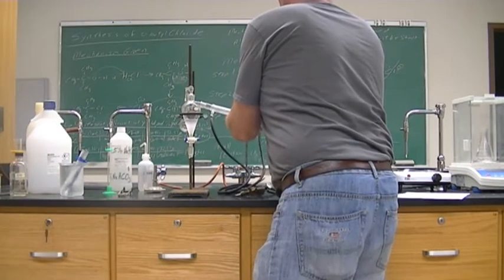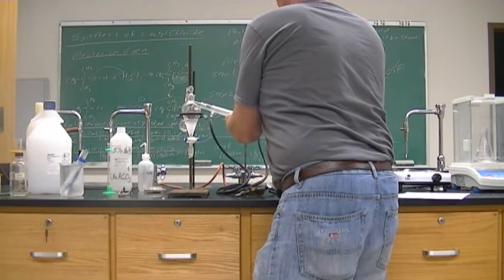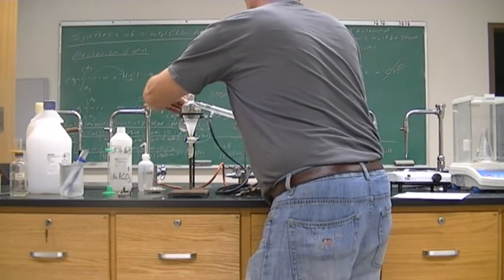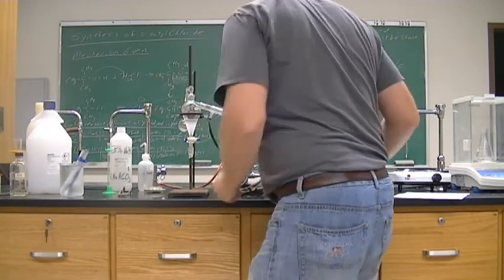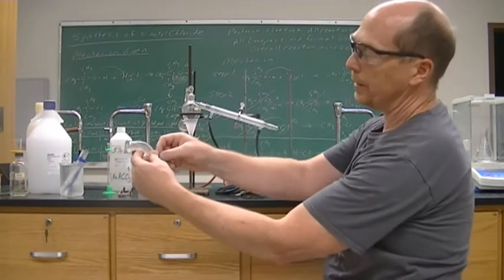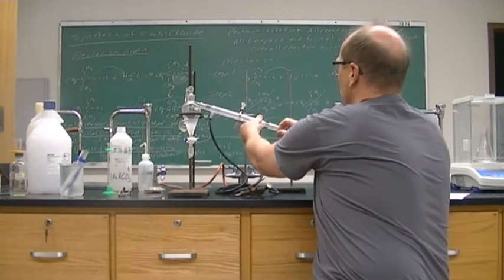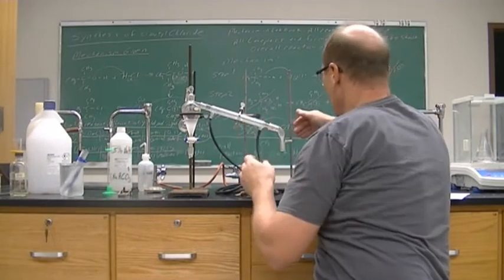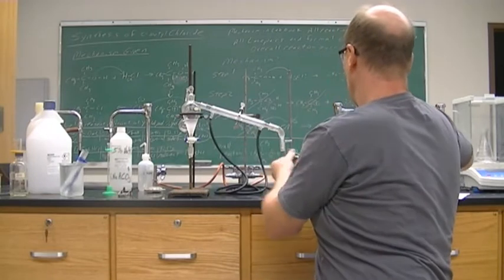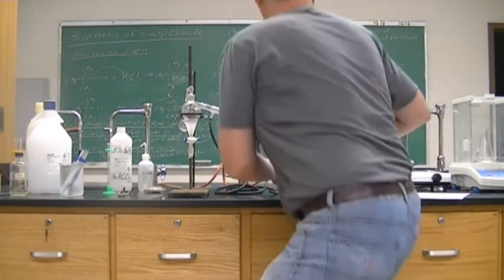A little bit. All right. Looks pretty good. And then this is what we will then collect it in. And it's got an air hole here so that it will not build up pressure. It will be released.